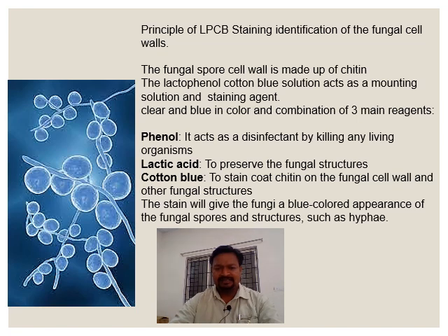One is phenol, a disinfectant that kills living organisms. Another is lactic acid, to preserve the fungal structure and clear the specimen, which helps keep the fungal structure intact. And an aniline dye called cotton blue stains the chitin in the fungal cell wall, giving the fungus color and highlighting and contrasting the structures.